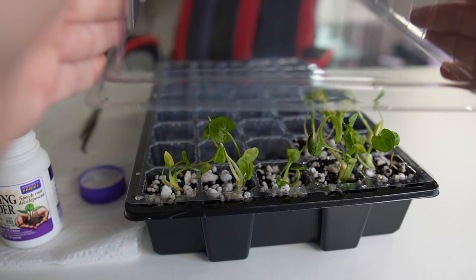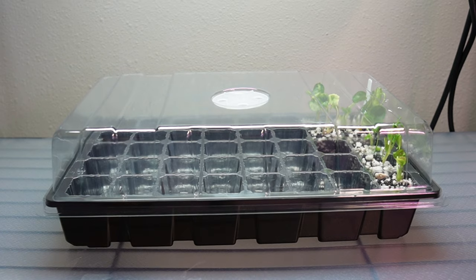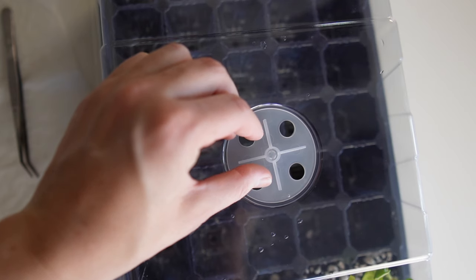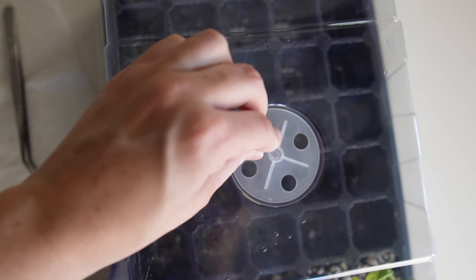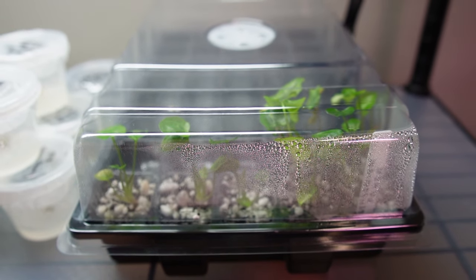Once all of the plants are planted, I close up the container and that's it. I love these particular trays because they have a vent that you can open and close to slowly reduce the humidity inside the container. When plants are growing in a tissue culture vessel, the humidity is close to 100%. To help the plants acclimate once you take them out, you want to keep the humidity as close to 100% as possible for the first week or two. I turn the vent so that it is completely closed to keep that humidity up. The media is already moist, so I don't add any additional distilled water at this time. I place the plants under LED lights, which are on for 16 hours a day and off for 8 hours at night.